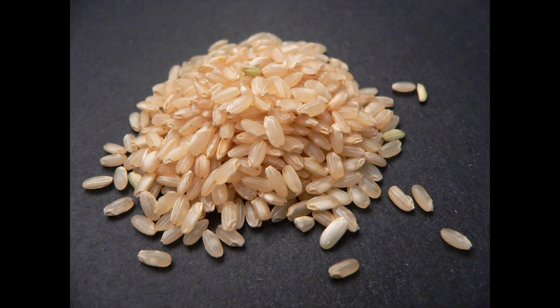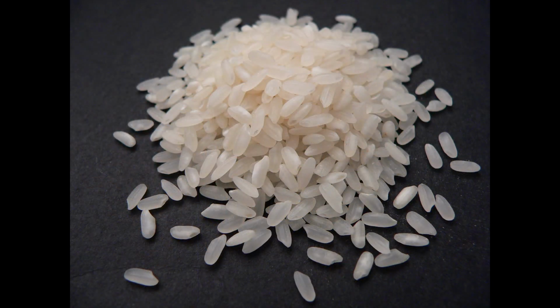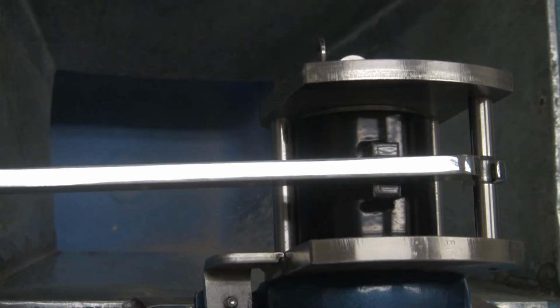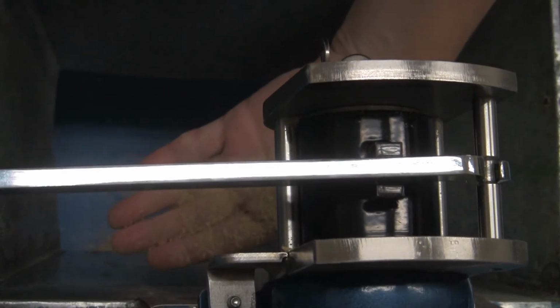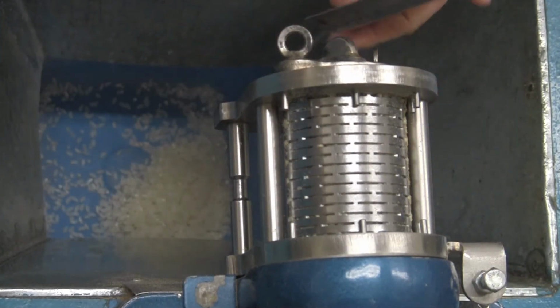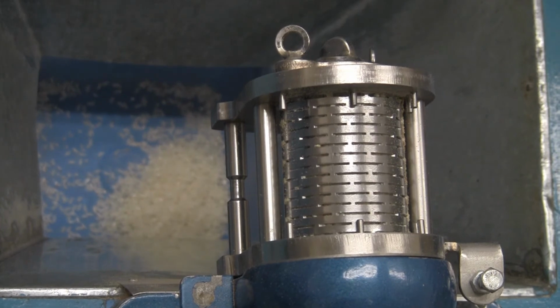The second step in the determination of whole grain yield is called milling or polishing. We take the brown rice sample produced from the dehuller and mill it for a predetermined time. During the milling process, the bran from brown rice is abraded from the grain. The bran is discarded and the white rice collected. Again, we record any observations about the physical rice produced.